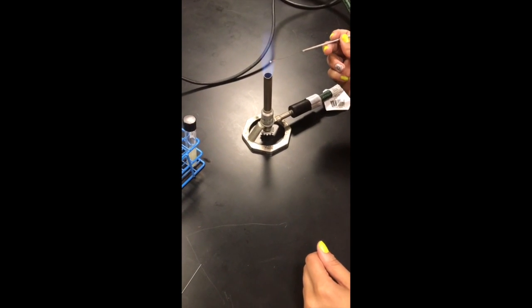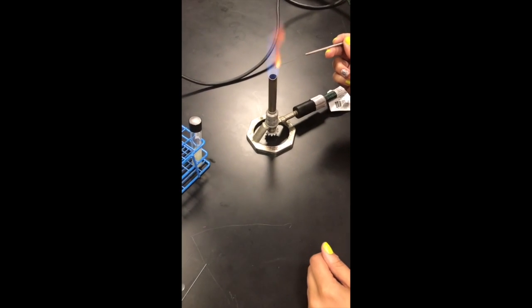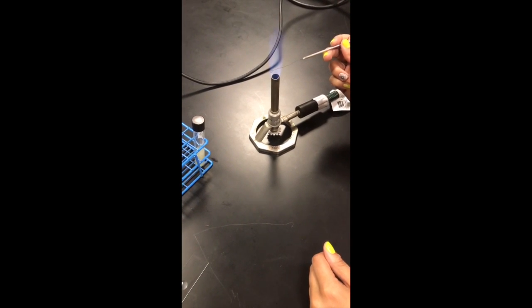Mix it into the DI water here. And then again, you'll want to flame your inoculating loop to get the bacteria off of it. And there it is.